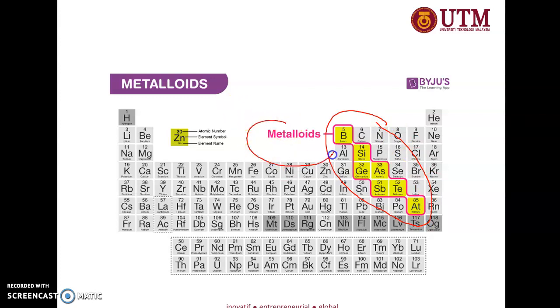Metalloids means semi-metals, half metal and sometimes not metal, according to their valency. Hydride generation AAS is also suitable for selenium, and very famous to be used with arsenic.